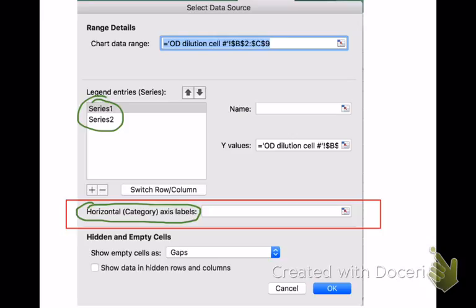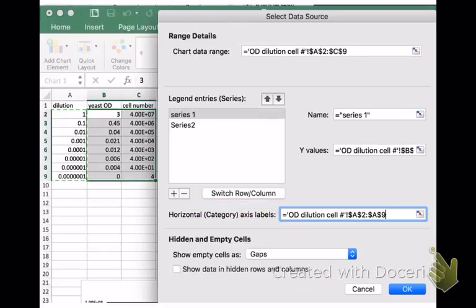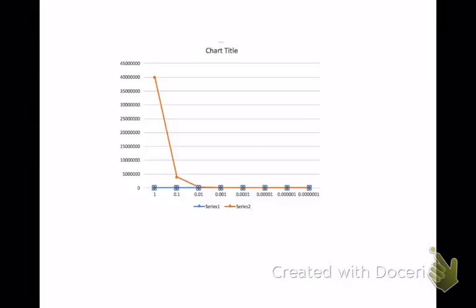Here's the window that I get after I hit that select data. So here's Series 1 and Series 2. We're going to ignore those for now. We want to select the horizontal axis, and we actually want to select the data that we want the software to use for the horizontal axis, because I didn't select that in the first place. There are ways that you could do it all more simply in one fell swoop, but I want to show you how you can go in and change things one bit at a time. And then after we select that, we're going to select this button. We're going to go and actually highlight the dilution series that we want to be the data that's used for that horizontal axis. Those numbers will now show up here. You can see that we've got A2 through A9. That corresponds to A2 through 9 over here. So it now knows what data we should use as a reference for the yeast OD and the cell number. And then we're going to hit OK.